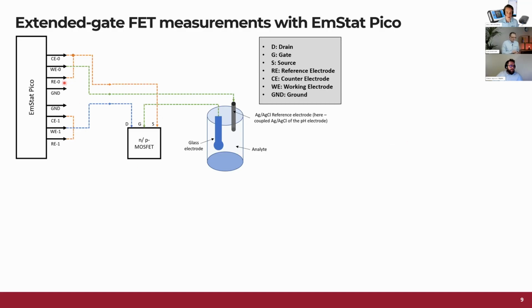Yeah, well, we just need the potential. So the two electrode system, we don't need the three electrode system to be separated in here. That's why we shorted the CE and RE together. And they're all against the same ground here. Yeah, no, that makes a lot of sense.